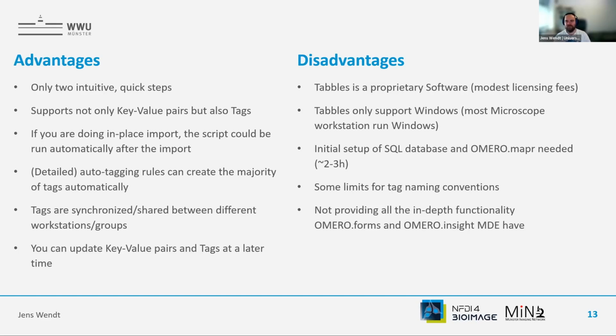To also be fair, the initial setup of the SQL database, if you also use OMERO MapR, is going to take a little bit of time, but this is basically on the side of the IT guys or the sysadmin. And I would say I'm moderately competent, and it took me like two or three hours. There are very good step-by-step tutorials out there on how to do it, and I also try to explain it as best I can in the GitHub README I put up. So if you run into problems, just ask me, or Google around a bit. It shouldn't be too hard.